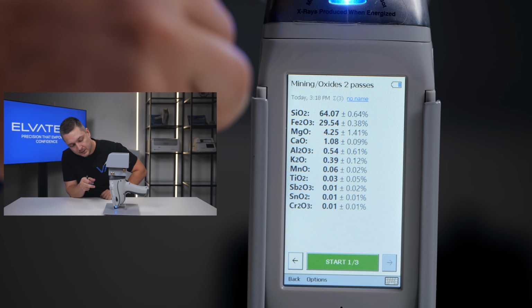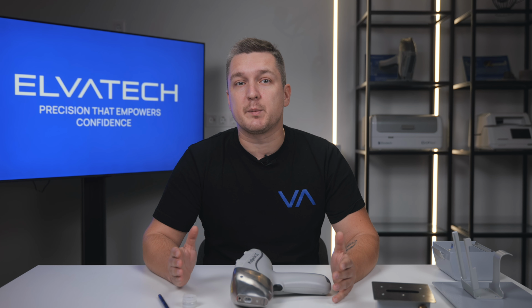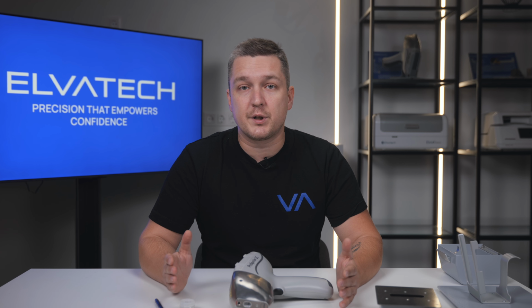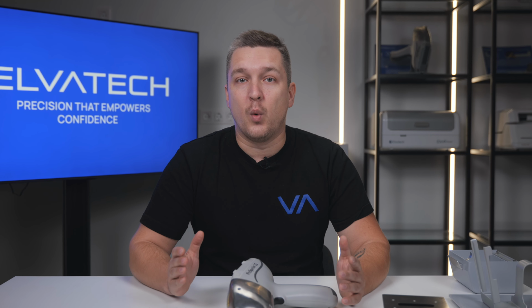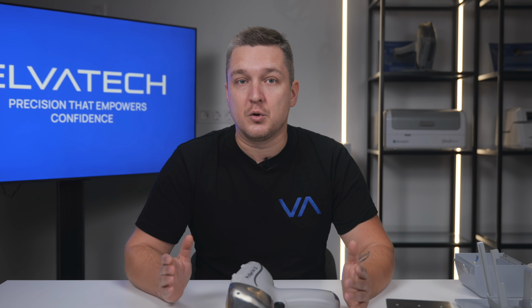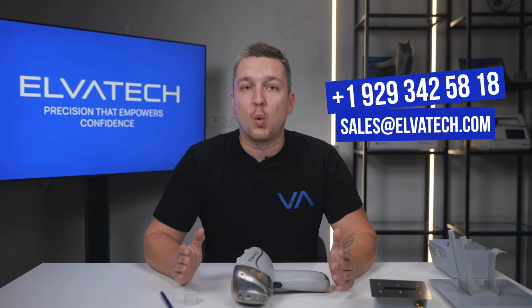So, we have just seen how the averaging feature in ProSpector 2 improves measurement accuracy and stability. It's not just an extra tool, it's a way to avoid errors and ensure confidence in every analysis. Want even more accuracy? Use averaging whenever you work with non-homogeneous materials.